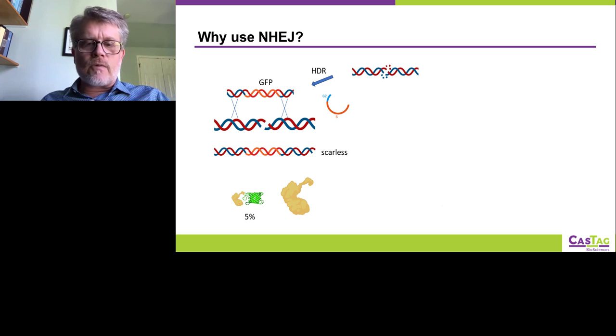In the cases where there's a scarred insertion with an insertion or deletion that throws the subsequent GFP out of frame, or for instance an epitope tag, those out-of-frame fusions are no longer detected as functional fluorescent protein or epitope tag. So essentially, those events are dark, and they're not part of the analysis in the subsequent functional analysis.